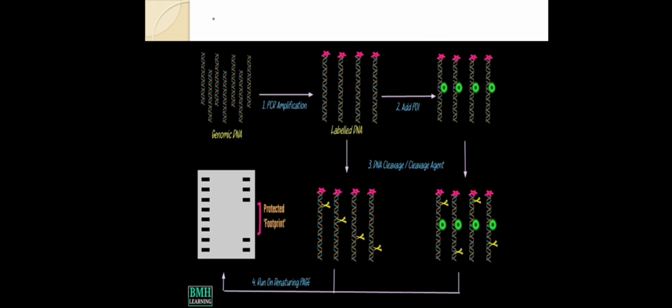the DNA footprint part. We will analyze this missing DNA footprint part by using DNA nucleotide sequencing systems. So after the sequencing, we will merge all the missing nucleotides and we will come to a clear conclusion where the protein and the DNA interacted.